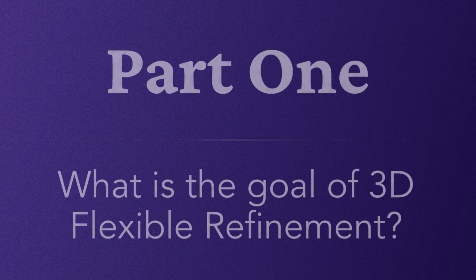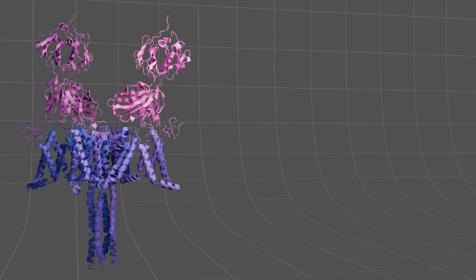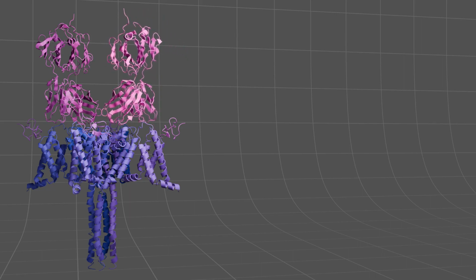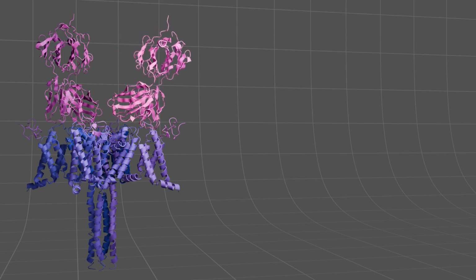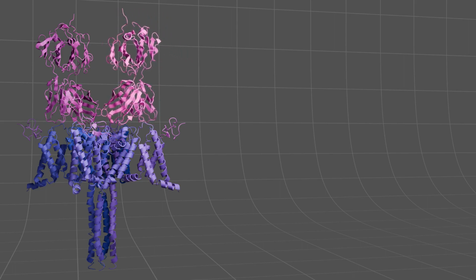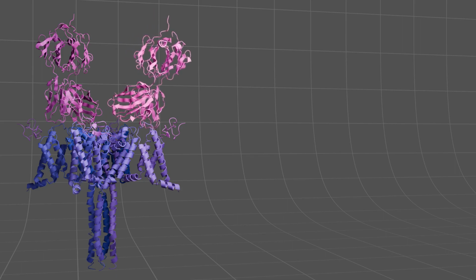I'm going to start by talking about what the goal of 3D flexible refinement is. What are we actually trying to do here? The answer, perhaps obviously, is that we know that these proteins are flexible, or that our targets are flexible, right? They are not perfectly rigid, stationary objects. And so the goal of 3D flexible refinement is to model that flexibility. 3D flexible refinement directly models per particle deformations. And the goal is that we can reverse these deformations to improve our consensus refinement using the information that we've learned about how these particles are flexing.